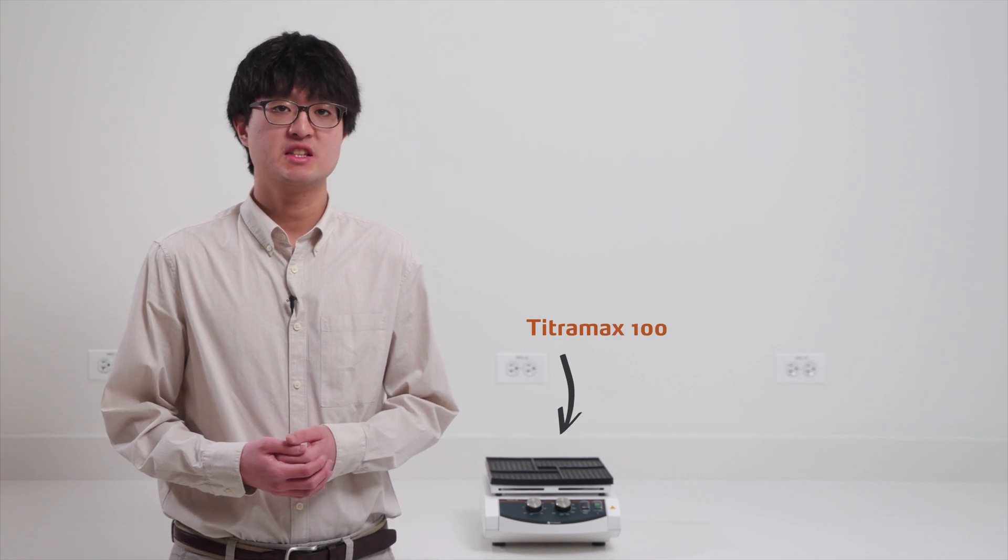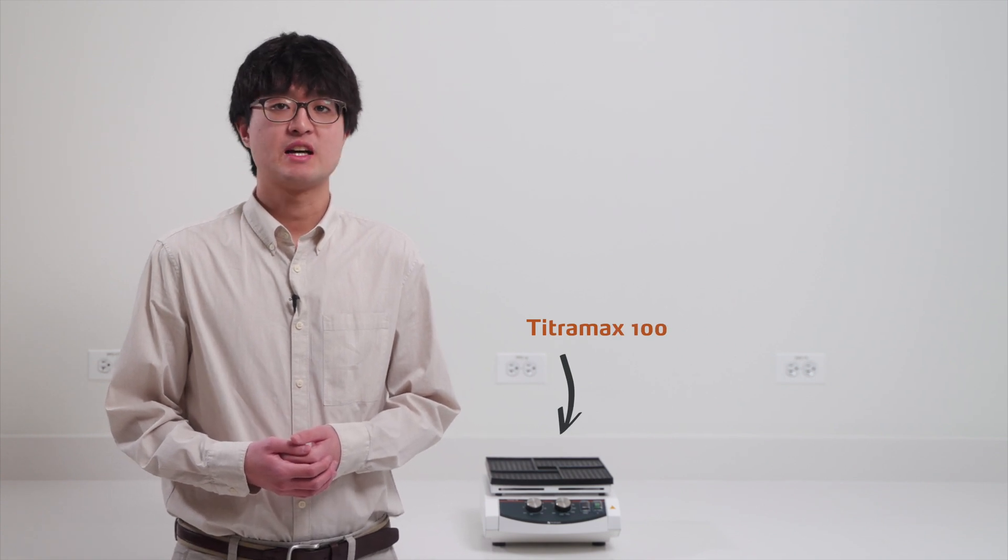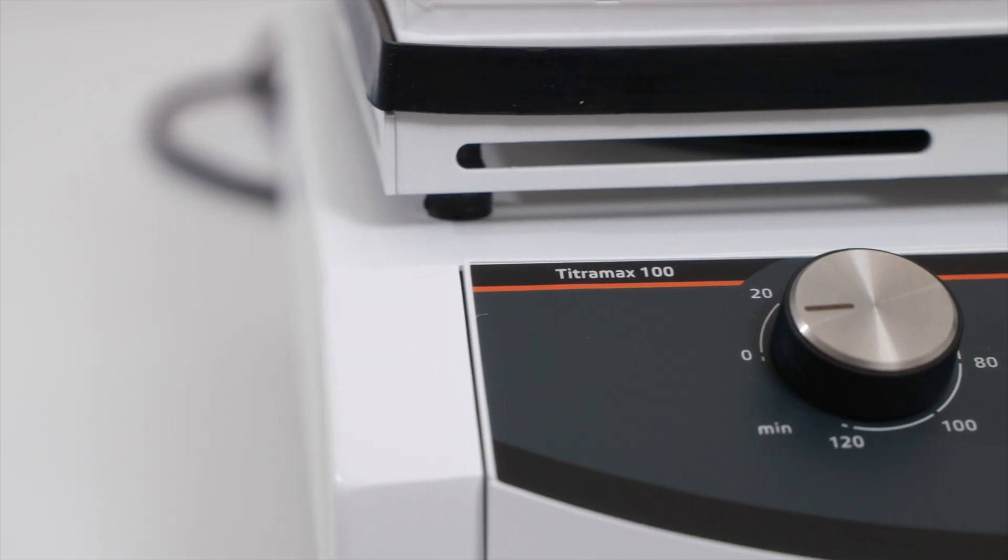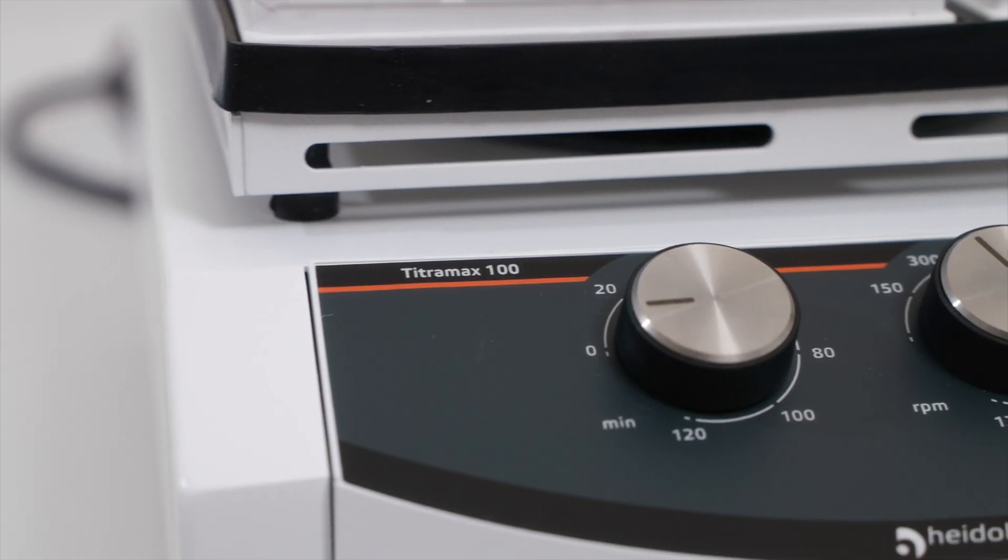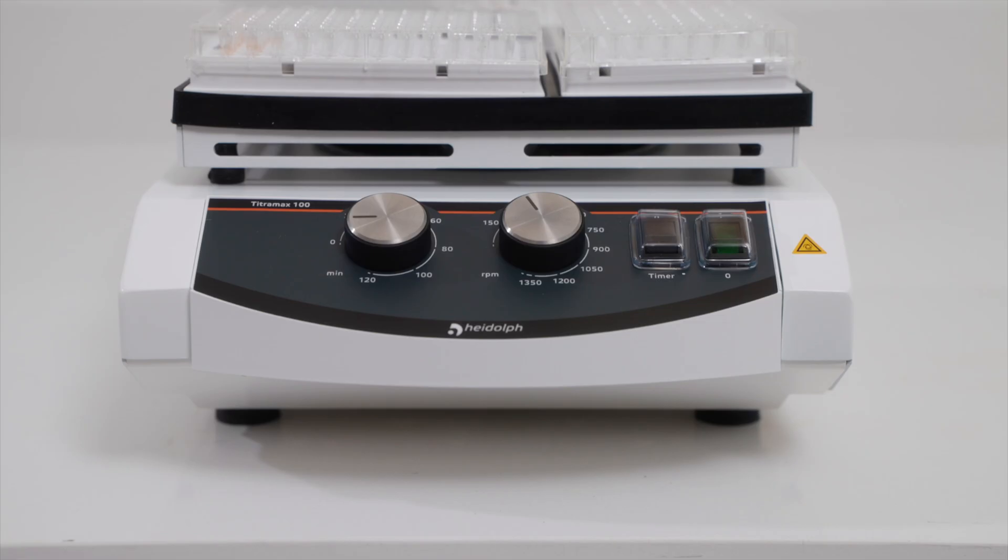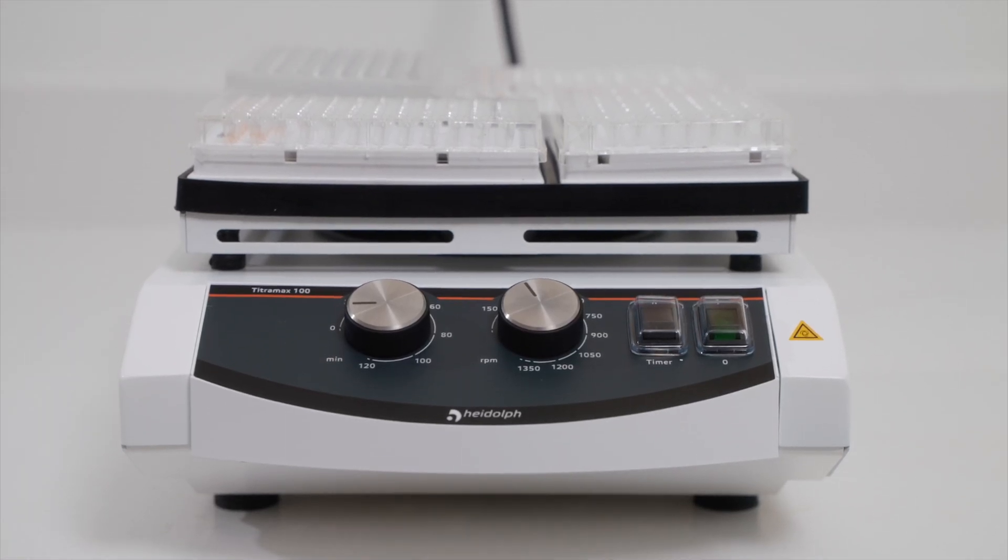The Titramax 100 is our standard model. This model has a compact footprint and can hold up to four micro-titer plates. In terms of specifications, the Titramax 100 has a guaranteed vibration orbit of 1.5mm and a speed range of 150-1350rpm.